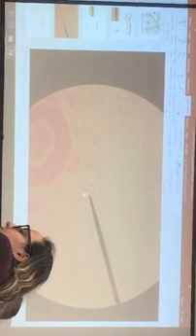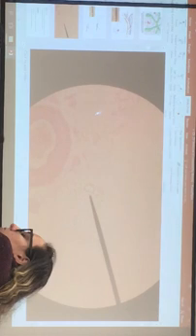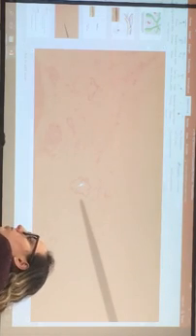That's the lymphatic vessel. It's not a vein, okay? Because they don't have any smooth muscle. And it's 1, 2, 3, 4, 5. This is a lymphatic vessel. And if we magnify it, sometimes we cut through the valve there, and you can see a little bit. That's a valve there.